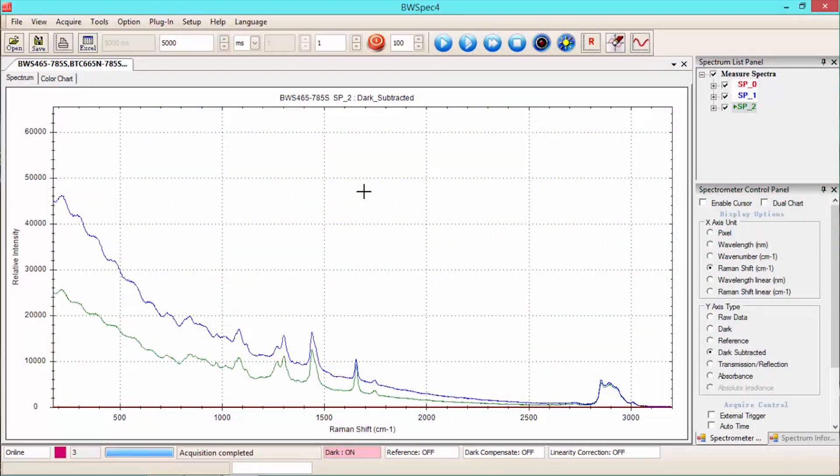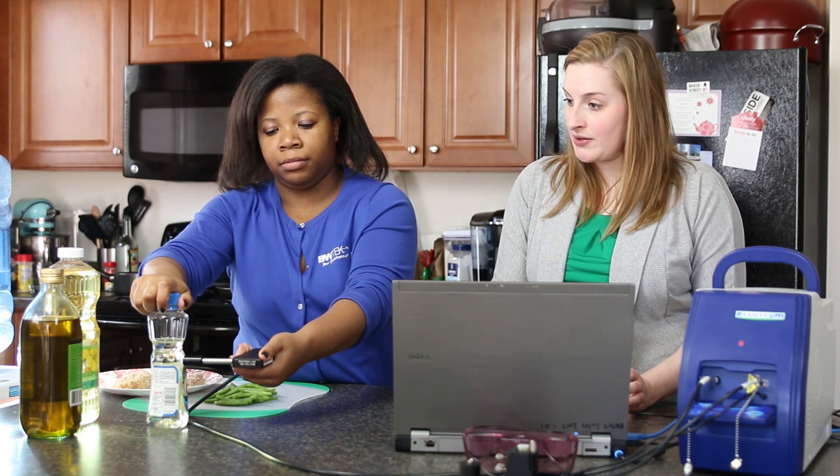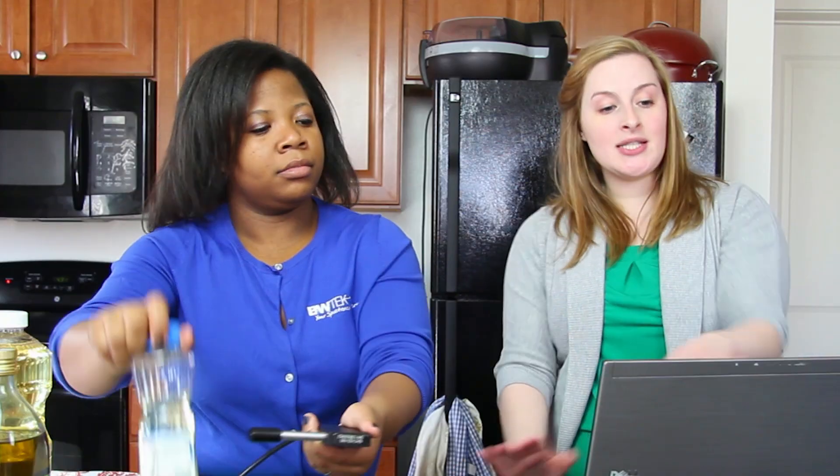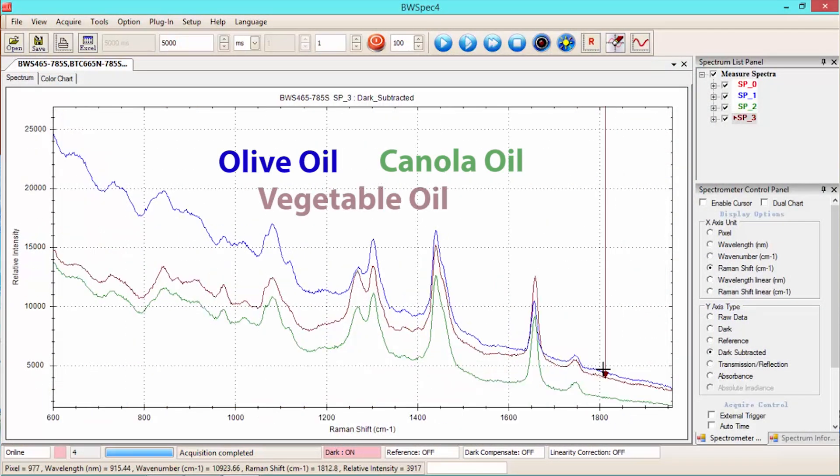And it also works out that Raman can measure through the plastic or the glass bottles, so it's really easy to do. Okay, and as you can see, the three spectra overlaid here, and they're very similar because they're all vegetable oils, but they're a little bit different because each one has a little bit different concentration than the others of the different ingredients that we talked about.